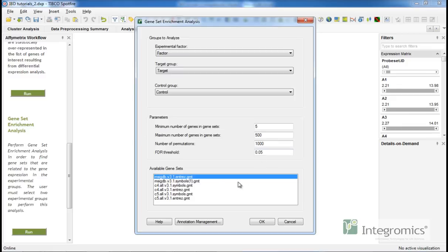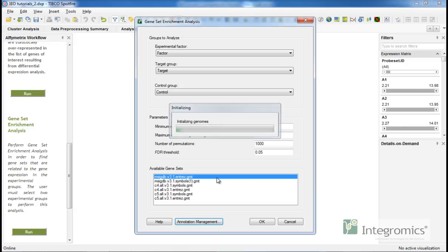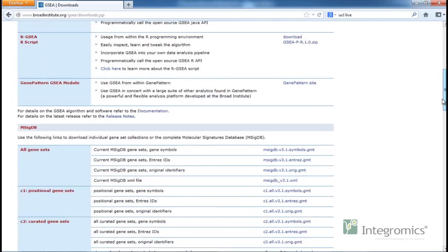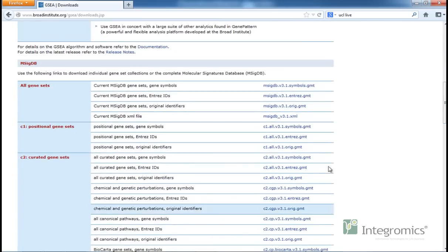Gene-set enrichment analysis requires predefined geneset collection files. These files can be downloaded from the Broad Institute. Only geneset collection files with .gmt suffix are supported in IBD.